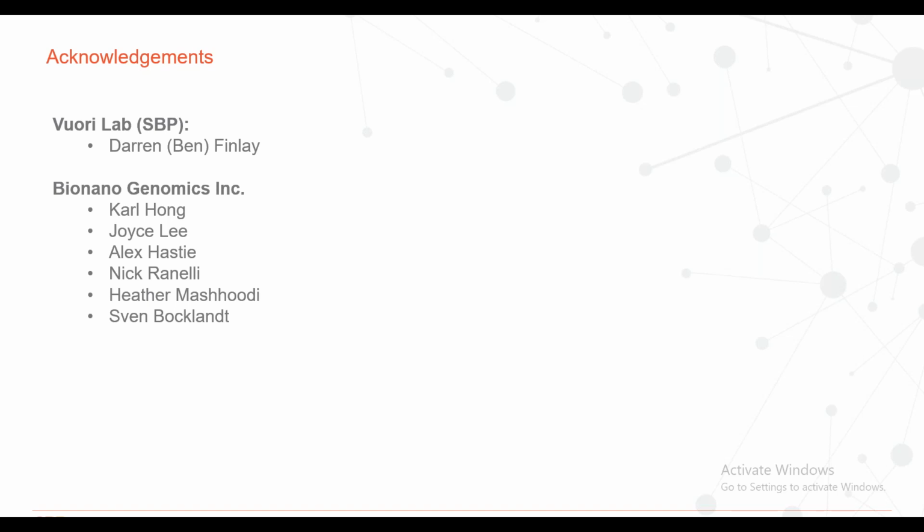We have, as far as I know, one published paper fairly recently on a metagenomics project using bacteria where different antibiotic resistance causing mutations were mapped with Bionano on a population sample of bacteria. So it's definitely possible. Talk to us if you have a specific project in mind, and we can maybe sit down and figure out whether it makes sense or not.